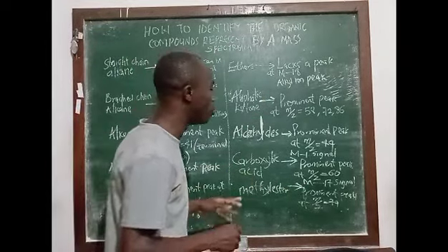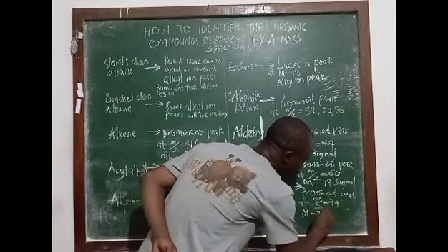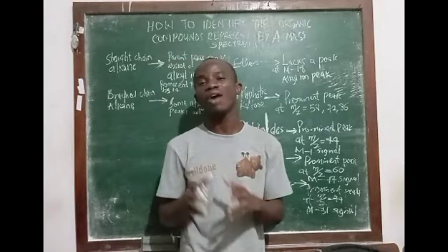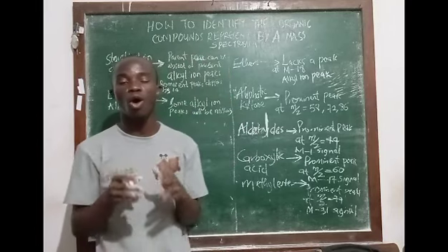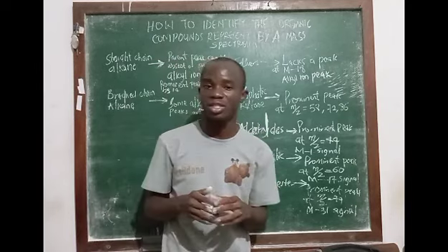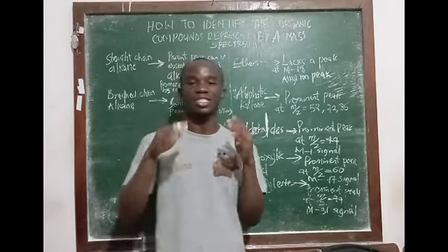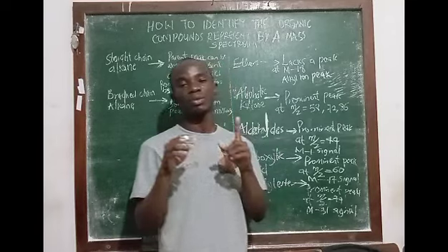And also for methyl esters, you will see an M-31 signal, which implies that if I have a parent peak at 100 in my mass spectrum, and that mass spectrum represents a methyl ester, I expect that there will also be a peak at 69, which represents the M-31 peak.